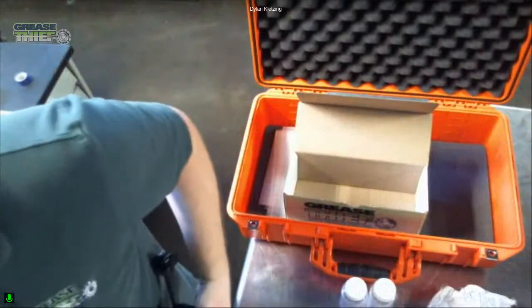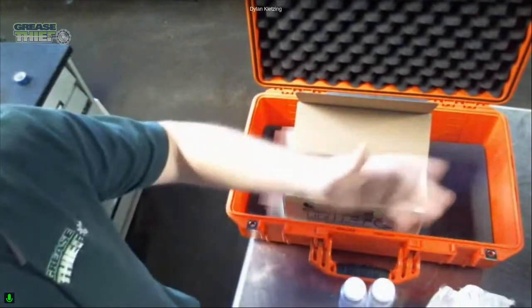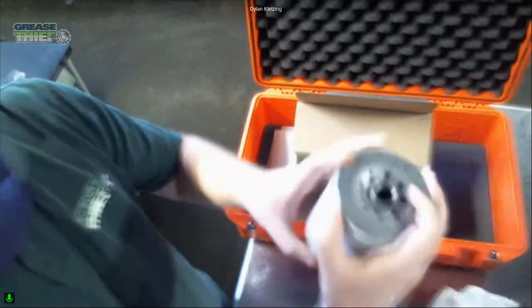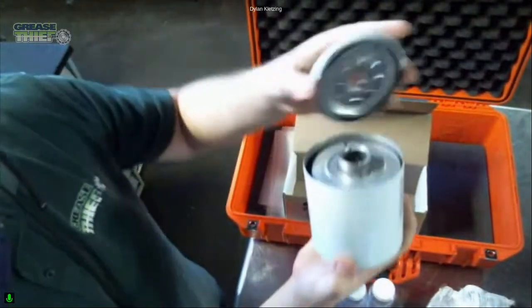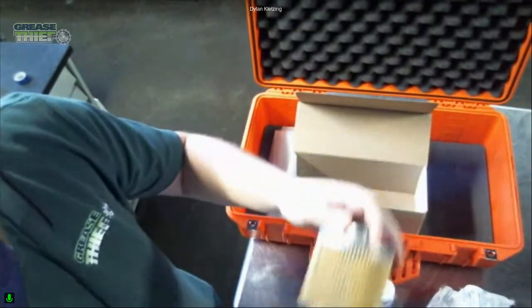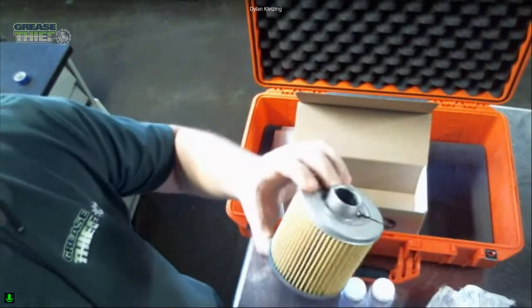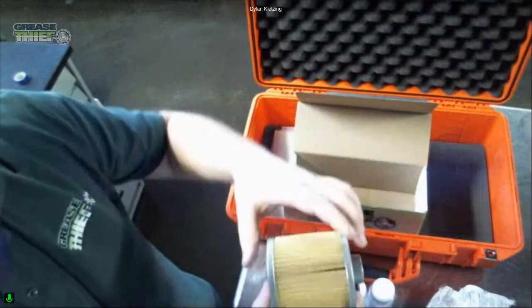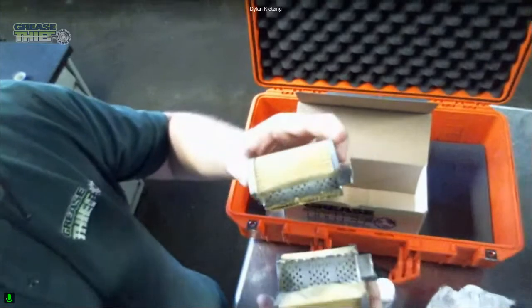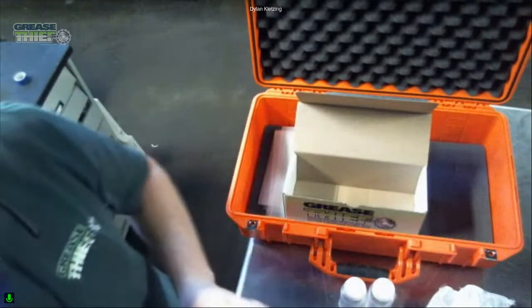I have a filter that's already cut here that I just wanted to show. Okay, the webcam is still good. So here we have this filter that was already cut. You see the top part was cut off there, and inside we have the filter media. This would be inspected with FTIR and with microscopic analysis, looking at the condition of the filter media like we had talked about. With our photoacoustic FTIR, we can see what's present on the filter media itself. So I just wanted to show that as well.